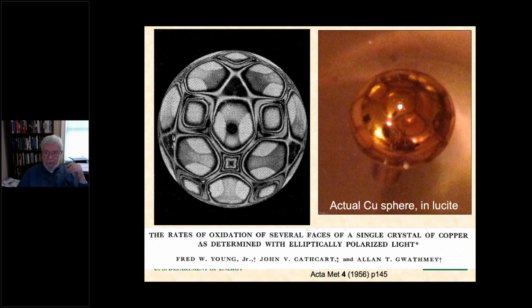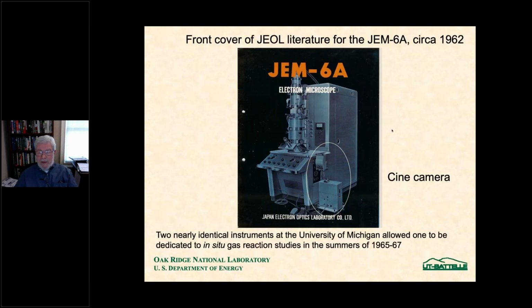Okay, so Professor Brockway saw this copper oxidation work that was done in the late 50s. And he started having ideas about how to study oxidation of copper in an electron microscope. And his association with Professor Bigelow, who was by then a professor in the Department of Chemical and Metallurgical Engineering, Professor Bigelow obtained funding for a couple of modern electron microscopes.